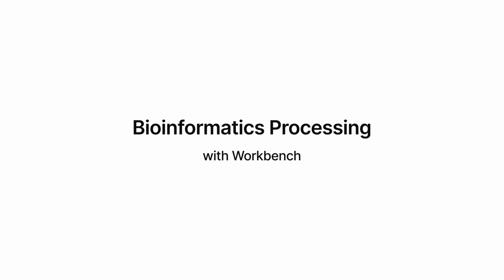In this video, we're going to show you how to perform secondary analysis of sequence data, including genome assembly, variant calling, and lineage assignment using DNAstack's Workbench.